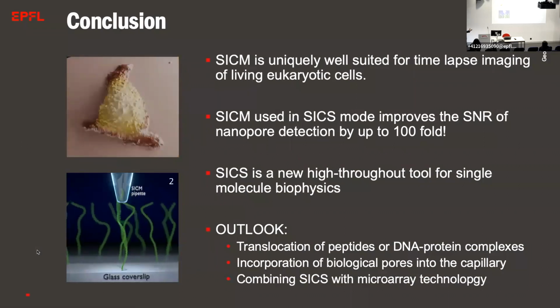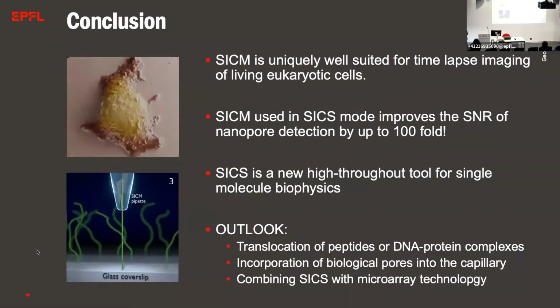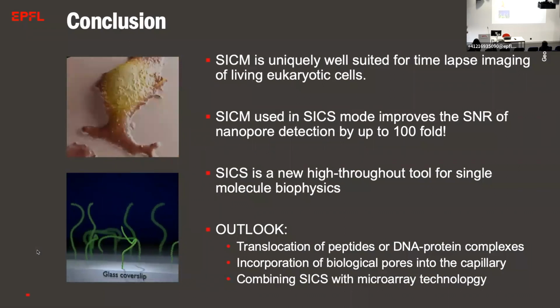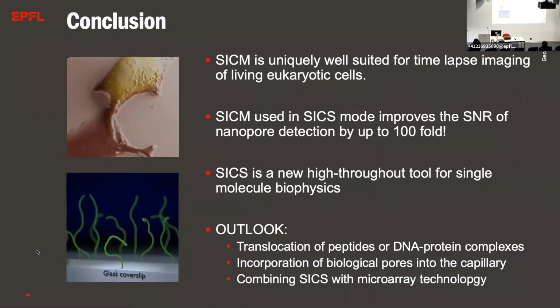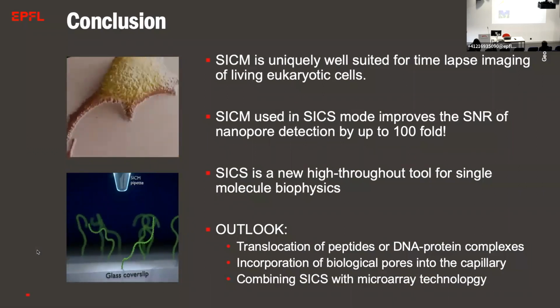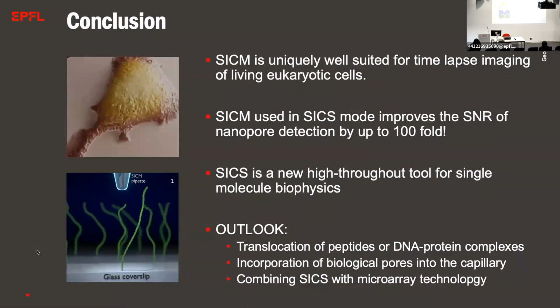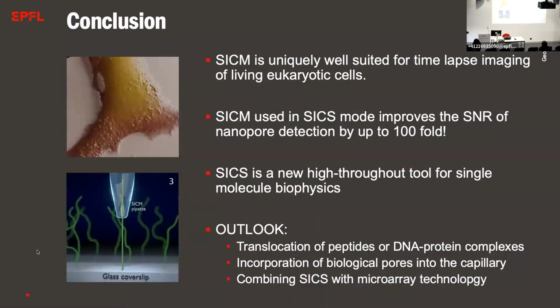And the reason why I'm happy to be here and part of this imaging center is that that's only one side of imaging, which is the image acquisition. The other side is the sample preparation, which is happening with lots of people that I consider the real microscopists. And then the next part is the image analysis and the image reconstruction, where there's also a lot of expertise here at EPFL. So that's why I think it's very exciting.